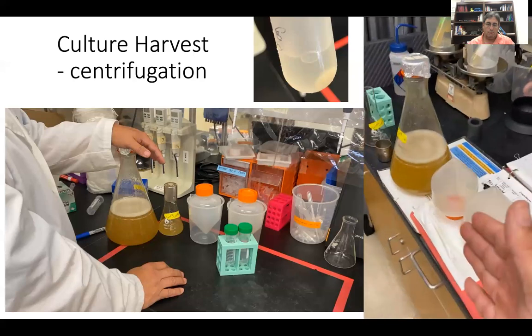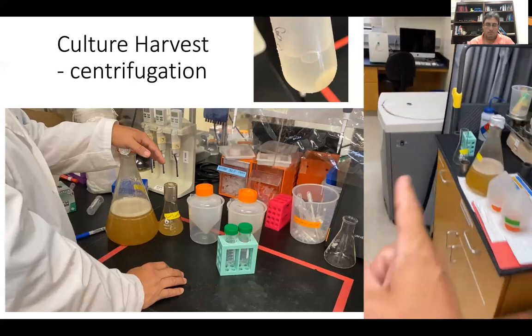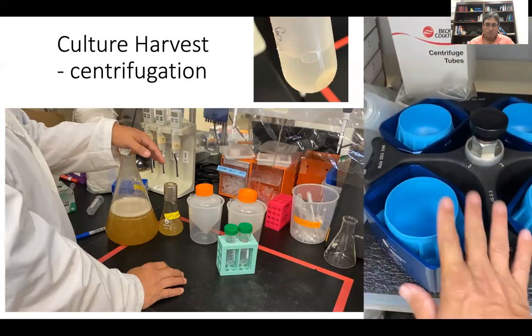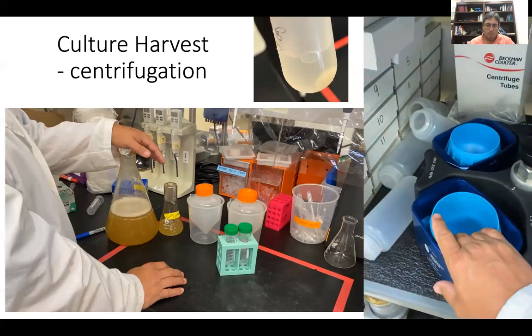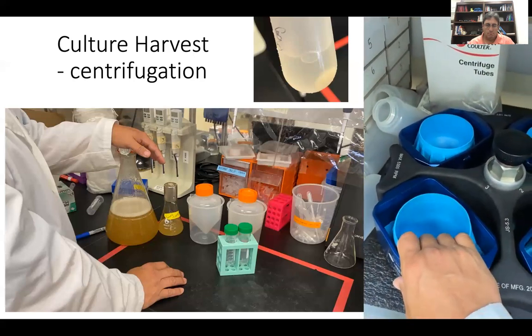For these tubes, we will just use a different centrifuge because the rotors for those tubes don't fit in the tabletop. But there's no problem for this. Again, we'll look at the rotor, we'll look at the instructions, find out how fast, how many RPMs to get 3,500 times G. For 10, 15 minutes, we'll take care of it, and then we'll have a nice pellet.